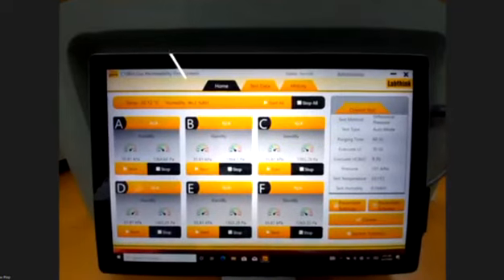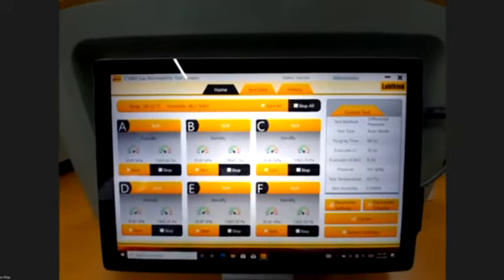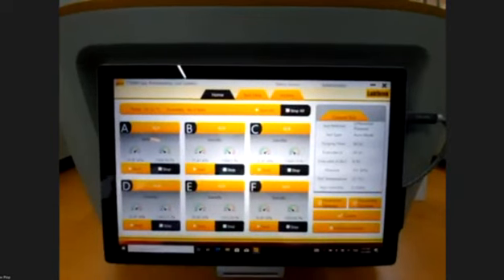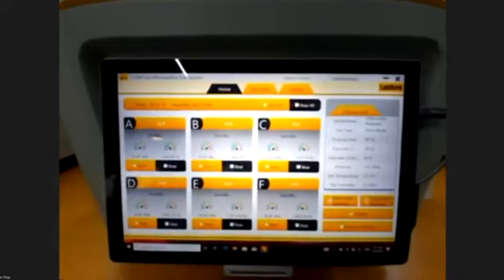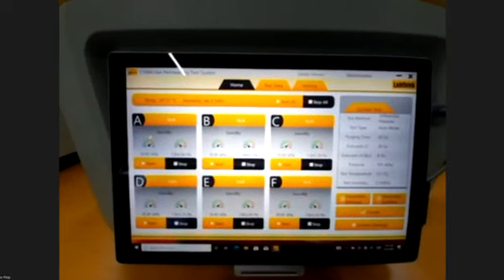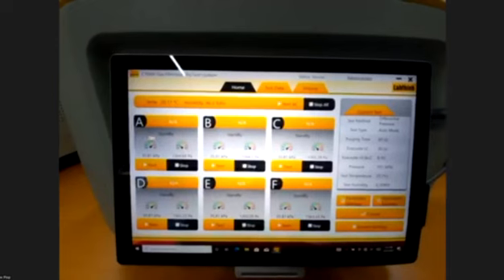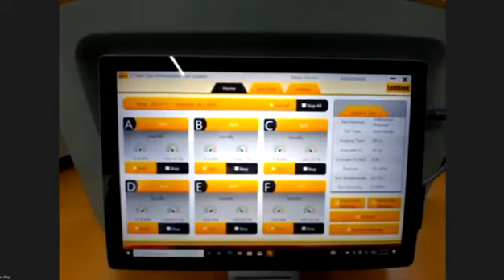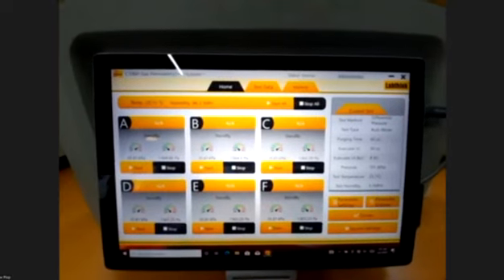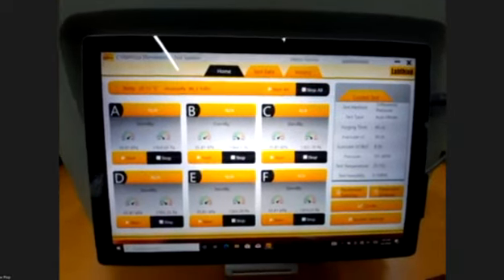Right now, if we want to start the test, I will just simply press start all and everything will be fine. Also, you can start and stop manually the cell. So you can just use, like I was telling you, blocks of 3 or only 1, and then you can manually start them from here.